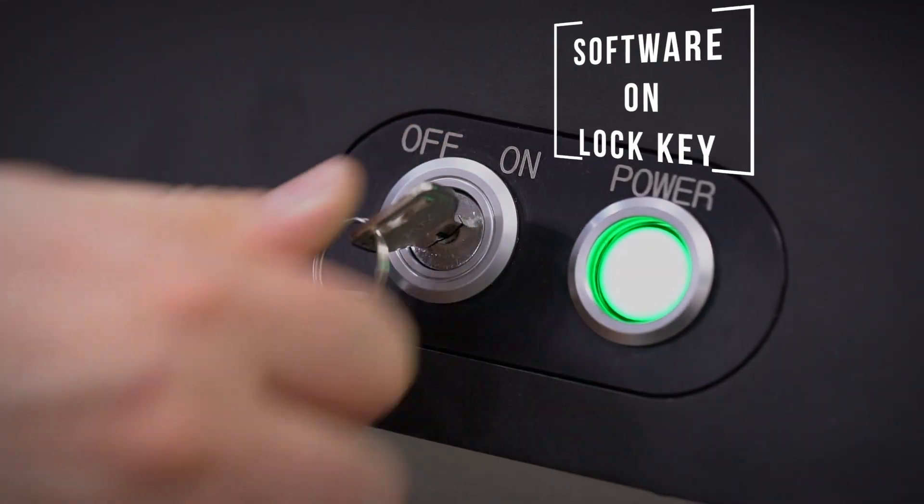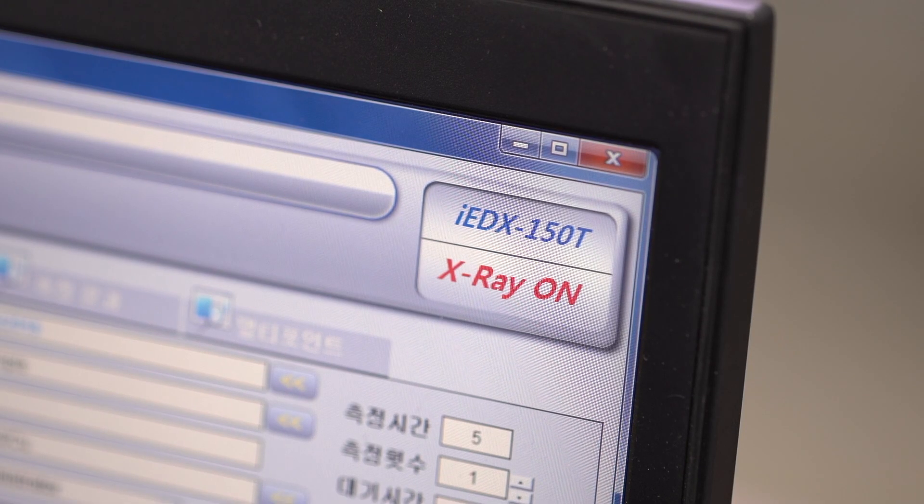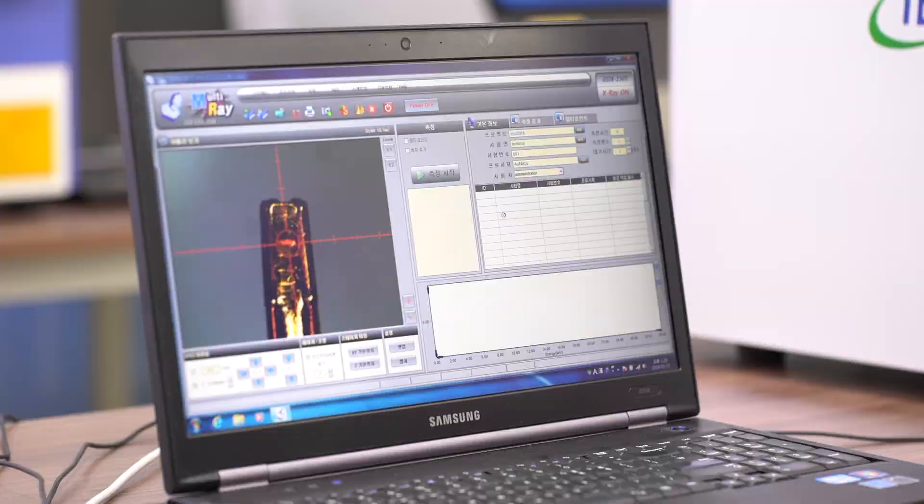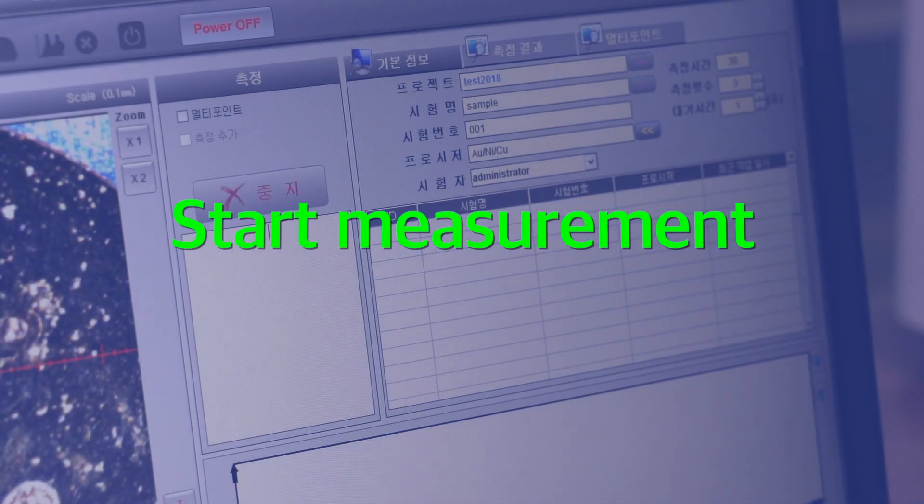Turn on the software lock key. Start measurement.